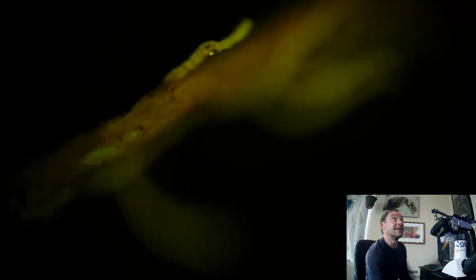But yeah, look how bright the glowing is. So this was just shortly off the base of the blueberry, because there are so many roots in the soil, I had to make sure that I got a blueberry root. So I traced around a thick root until I could make sure that I grabbed hold of a root that was connected to it. Pretty wild looking. Definitely way more root hairs than any of the other roots.